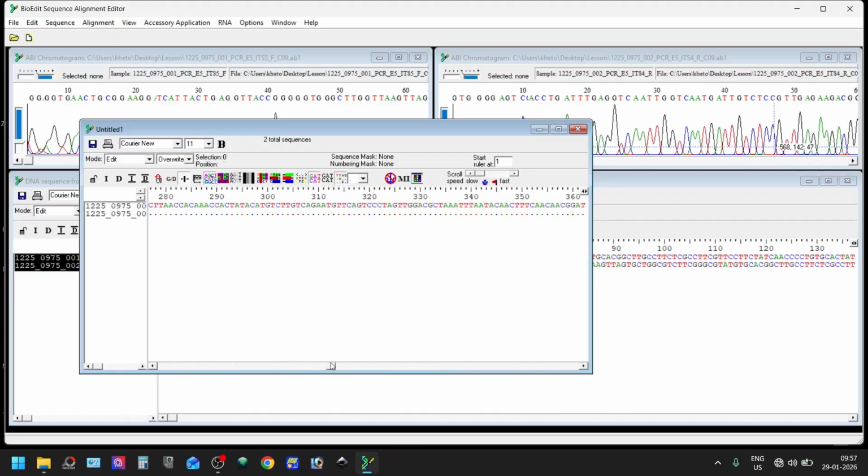You see, this is completely aligned. If your file is like this, for example, it is aligned very properly. You can click this one to see your sequence. You can click here to see if there are any changes between the two sequences. So you can see it is aligning very well from here. You can just delete this one, then go from here and check if there are any differences between the two sequences.